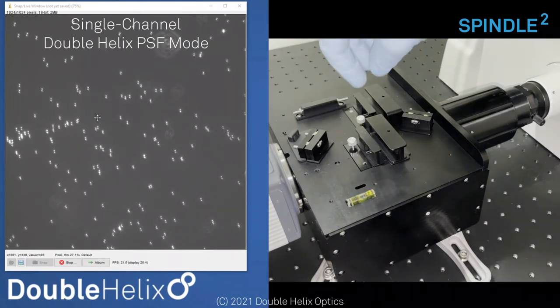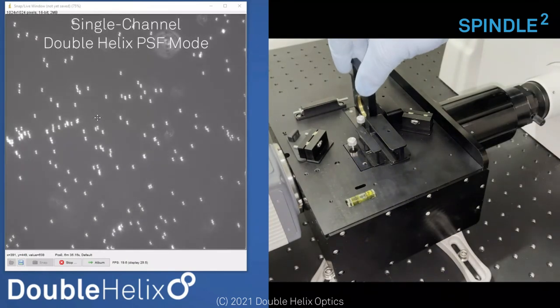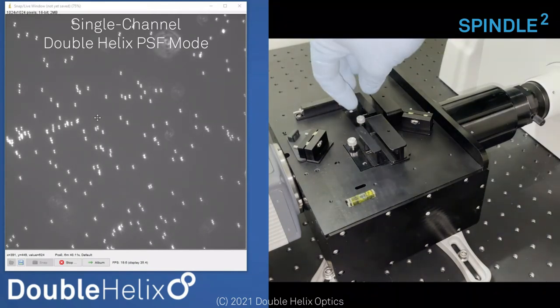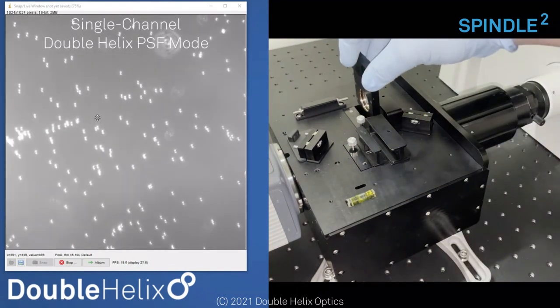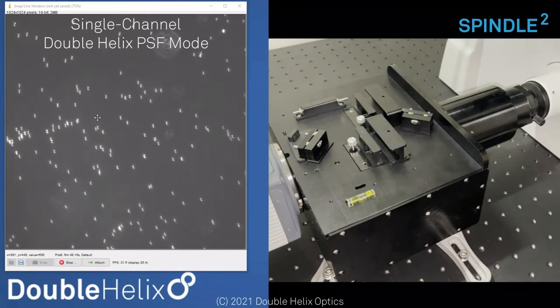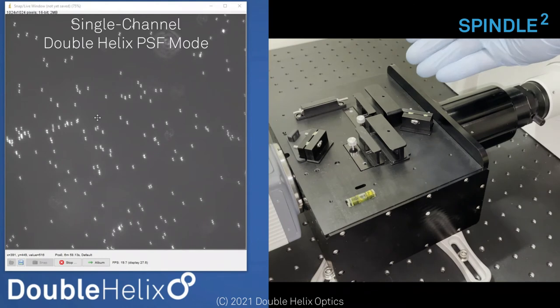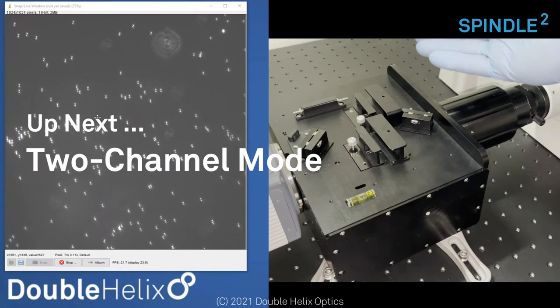We also have a secondary emission filter here. Right now I have Cy3 in there, but I can insert a blank — we just want to block excess light from coming into the body. Those are the primary mechanisms you'd use to either image in clear aperture in a total bypass mode, or to insert one of our phase masks to use the system in a one-channel engineered PSF mode.